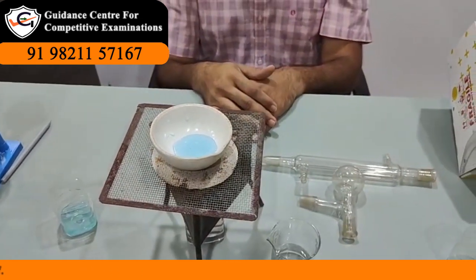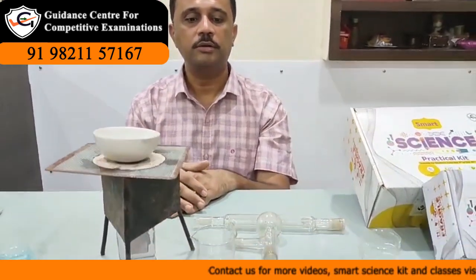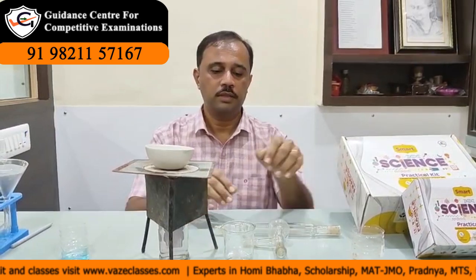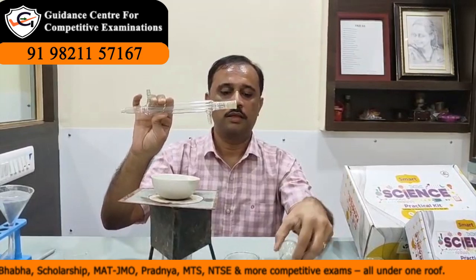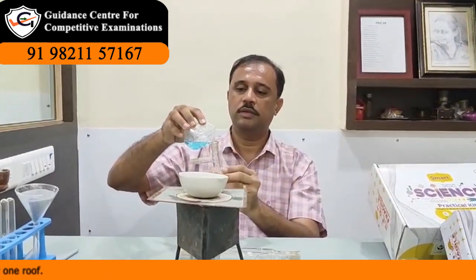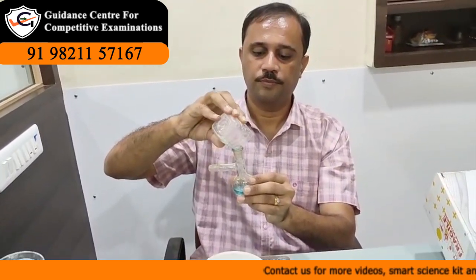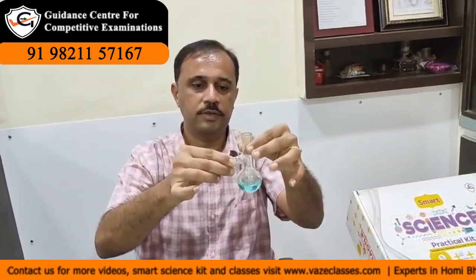But now the question is, if we want solute and solvent, that is water and copper sulfate, both back, then what will you do? Then we have to make use of the distillation method. Here this is a condenser to condense the vapors, and this is the distillation flask where we can take the filtrate, that is copper sulfate solution. Let us transfer some amount of copper sulfate solution to it.